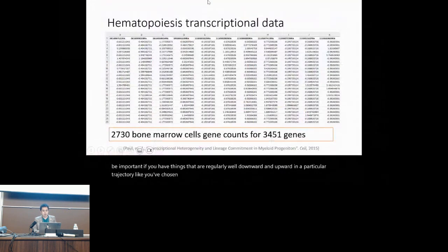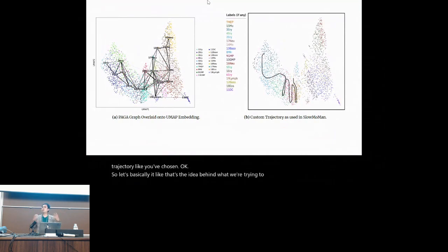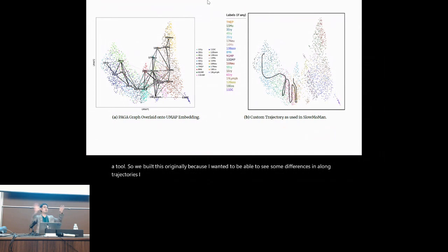Okay, so that's basically it. That's the idea behind what we're trying to do: build a tool. We built this originally because I wanted to be able to see some differences along trajectories, and I didn't just want to do a cluster by cluster analysis.